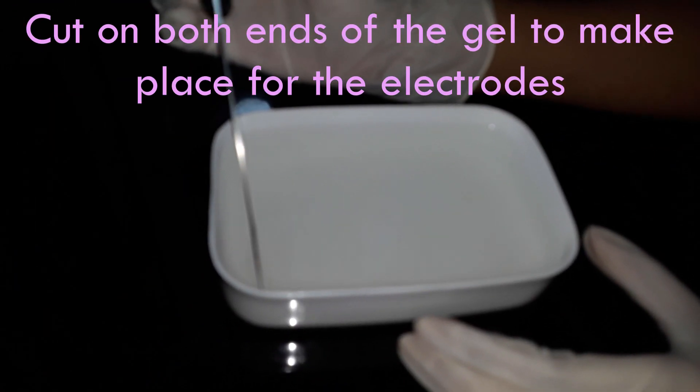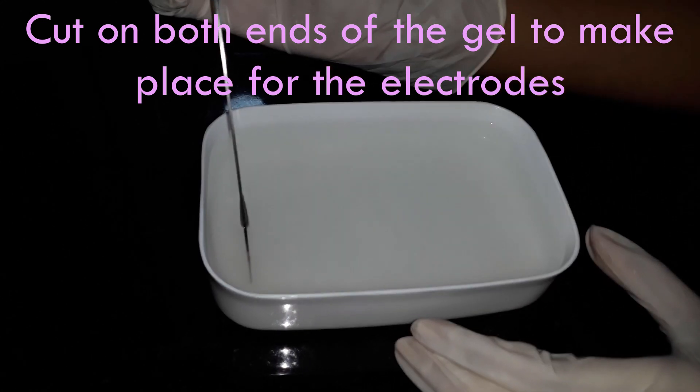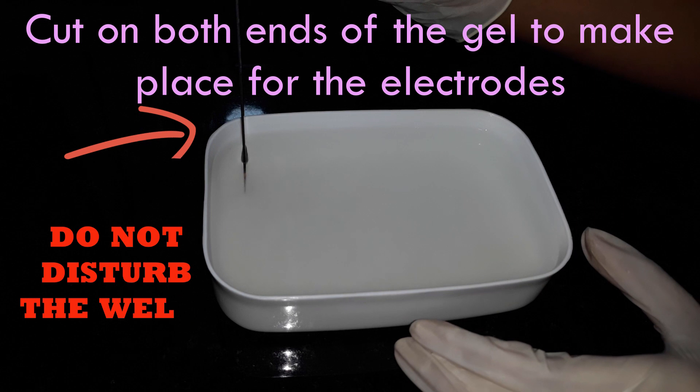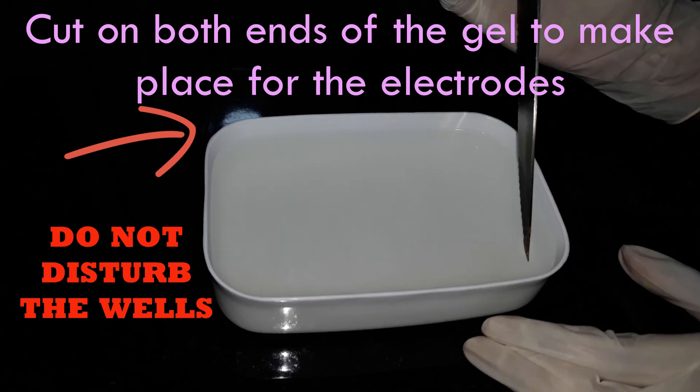Now, we have to make 2 cuts at the 2 ends of the chamber for inserting the electrodes. Make sure to not disturb the wells in this process.